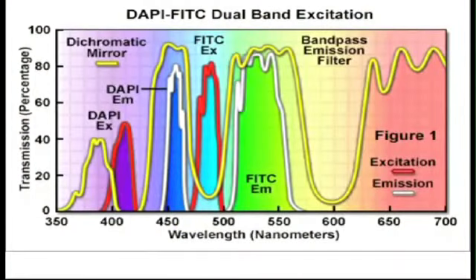We then place the Flowcell in the microscope, which is fitted with a xenon bulb and an FITC filter to allow the SYBR signal through. Using a 40x objective lens gives us a clear view of the clusters. We have a camera and computer attached to the microscope. This isn't necessary for the QC, but it helps us with tracking.